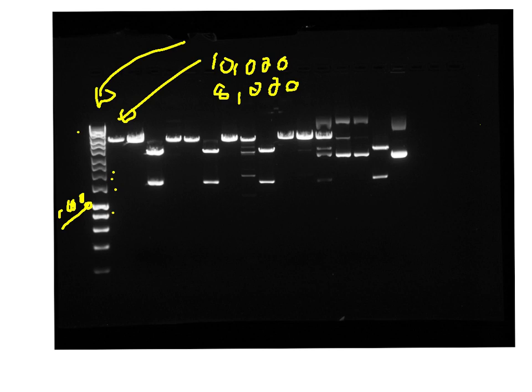Our DNA fragments are electrophoresed. If we look at the uncut plasmid DNA that we put on the gel just here, what we see is 2 bands, one very intense one and one kind of fuzzy one, so there and there.